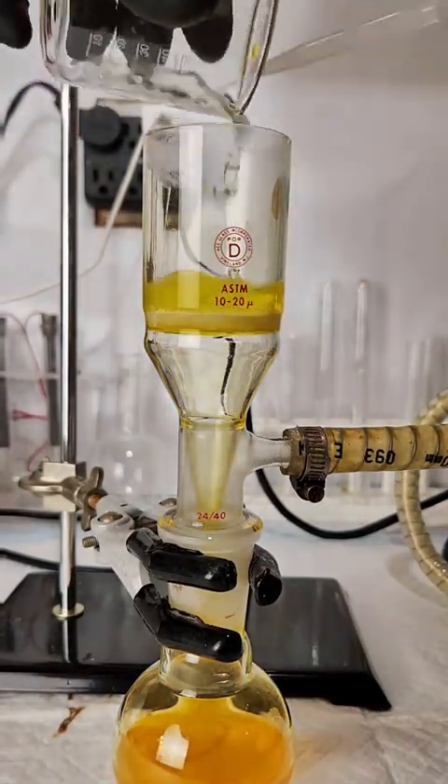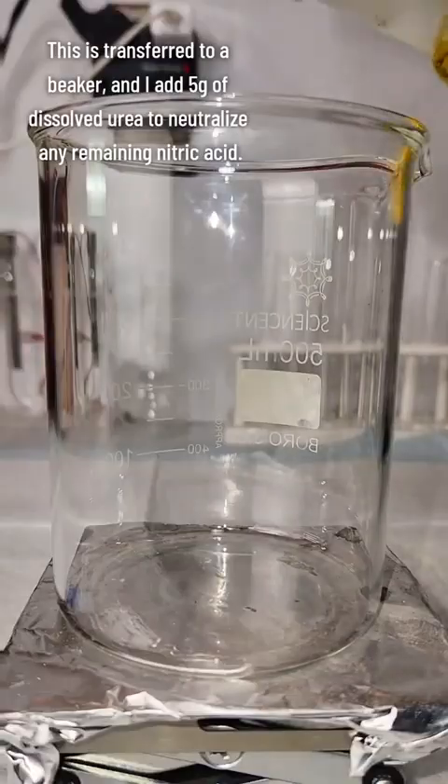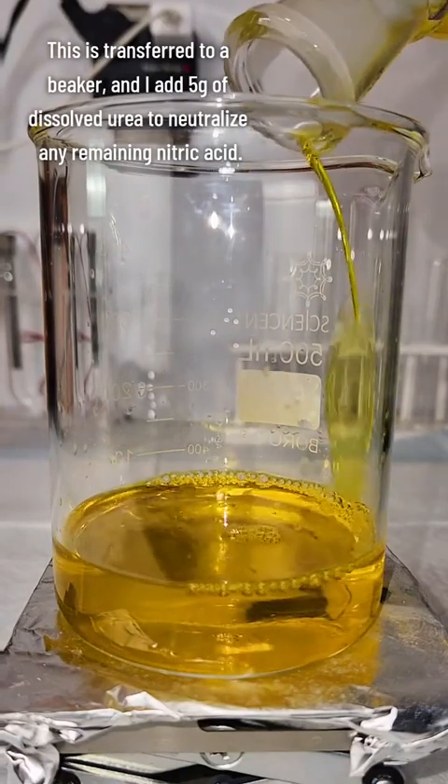One quick thing to keep in mind is that chloroauric acid is actually very volatile, so if you boil the solution too hard, you can actually evaporate your gold — as crazy as that sounds.